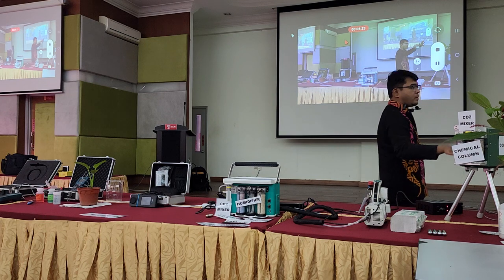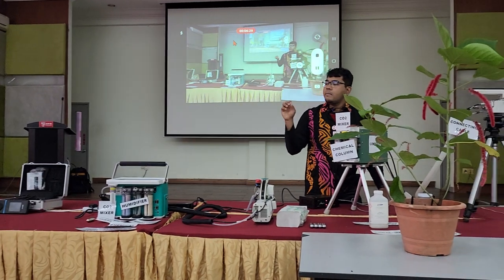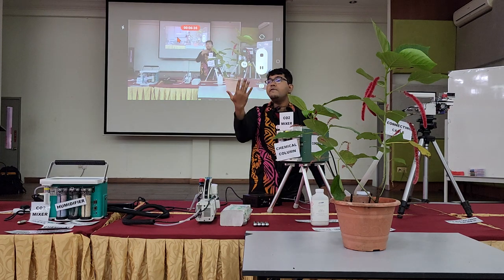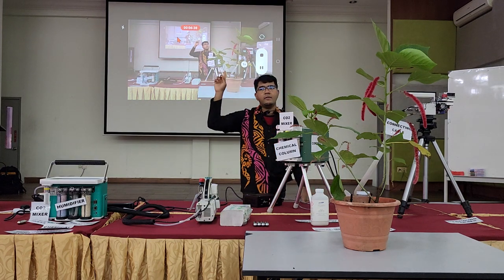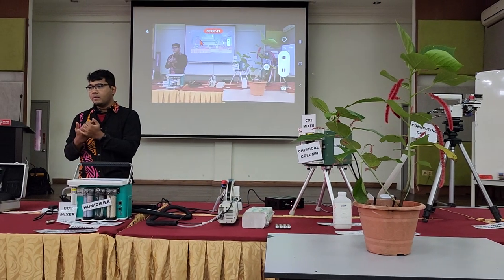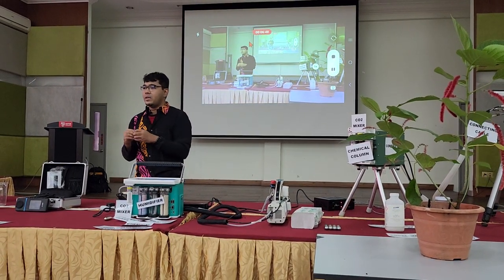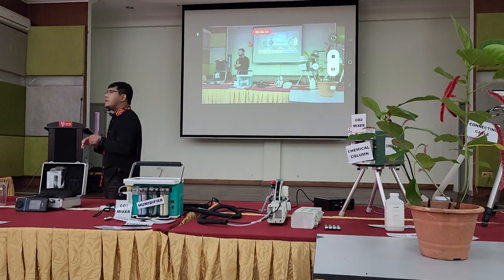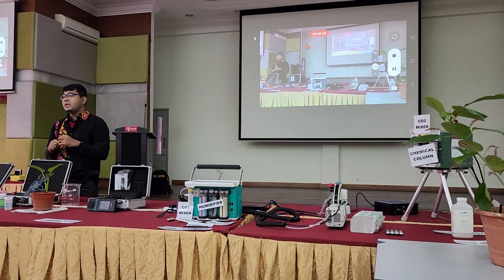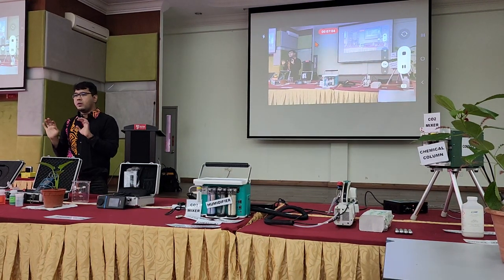Okay, so with this equipment, some measure what's happening in the plants, and some are actually measuring the environmental factors influencing the plants. There are many factors in the surroundings influencing the plants. We call these abiotic factors. Or sometimes in books or Wikipedia, they like to call it abiotic stress. Well, it's not really a stress when it is in the right dosage, time, location, and so on. When something is excessive or under-given, then it becomes a problem.